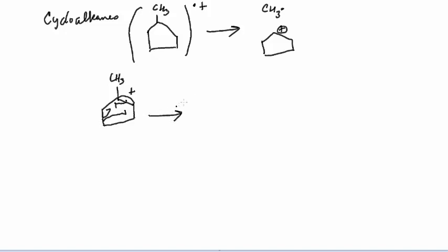Pretty interesting. So that's going to produce basically a neutral alkene, propene, and what amounts to a 3-membered ring radical cation, which structure we could draw like this. That might look funny. That's 1, 2, 3 carbons, like a 3-membered ring, with one of the electrons being a 1-electron sigma bond.